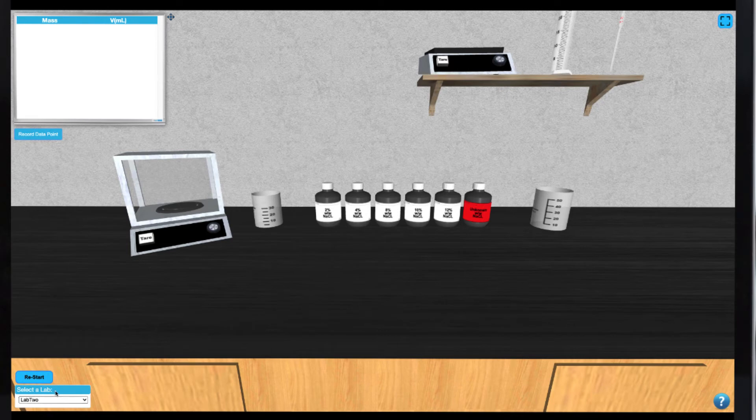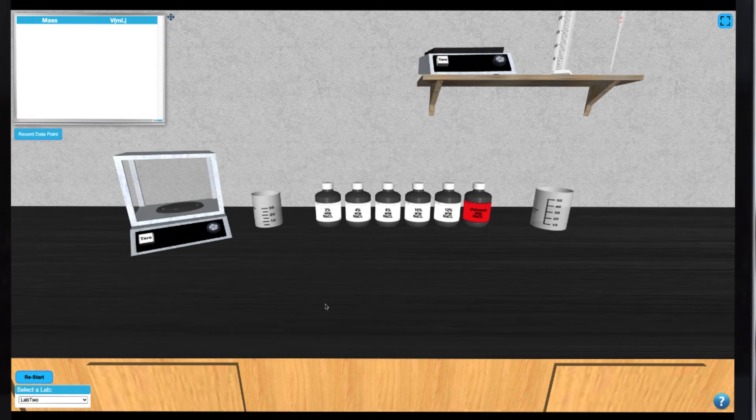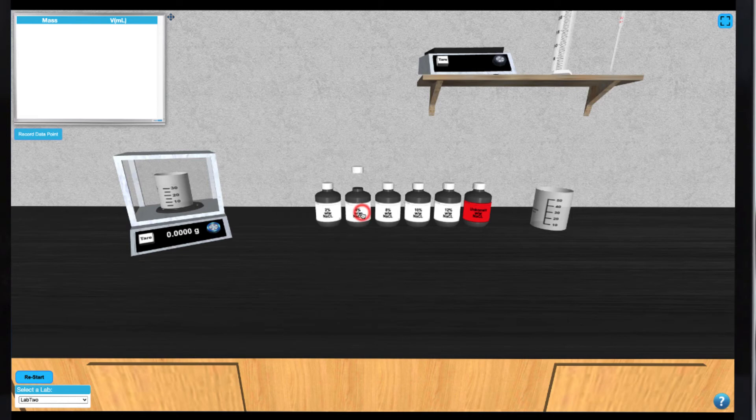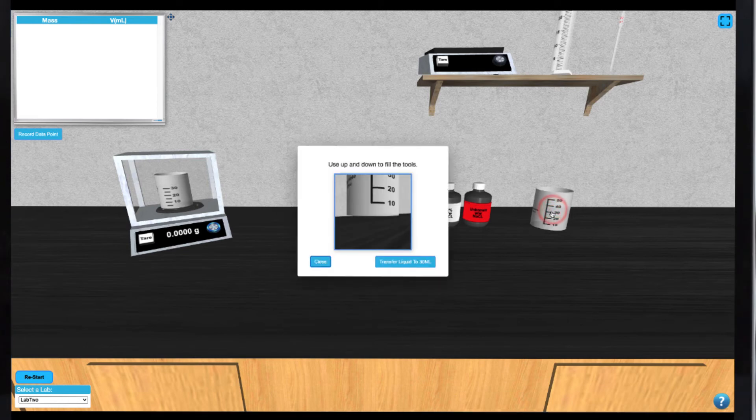In this simulation, we have several bottles of stock solution at various concentrations of sodium chloride. Again, we can tare the mass of our 30 mL transfer beaker before we begin. To select one of the sodium chloride samples to work with, simply click on it.